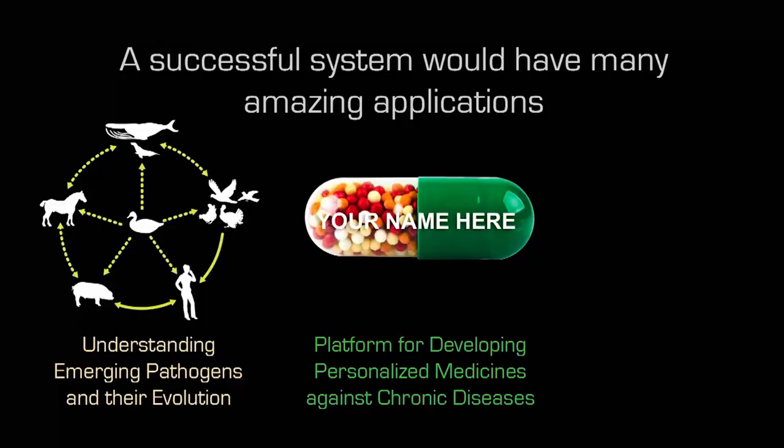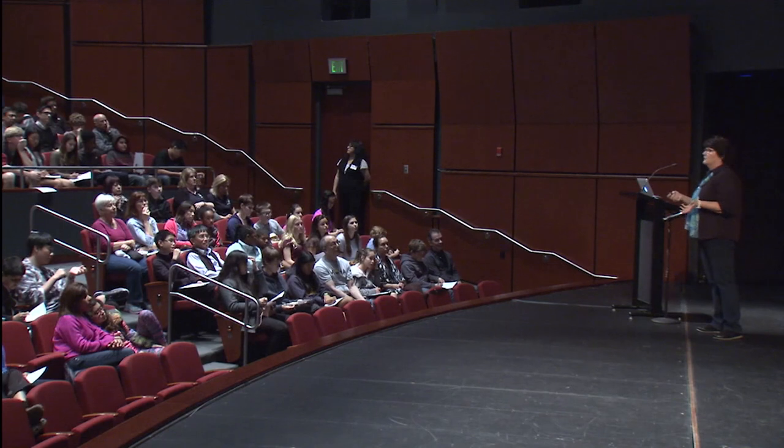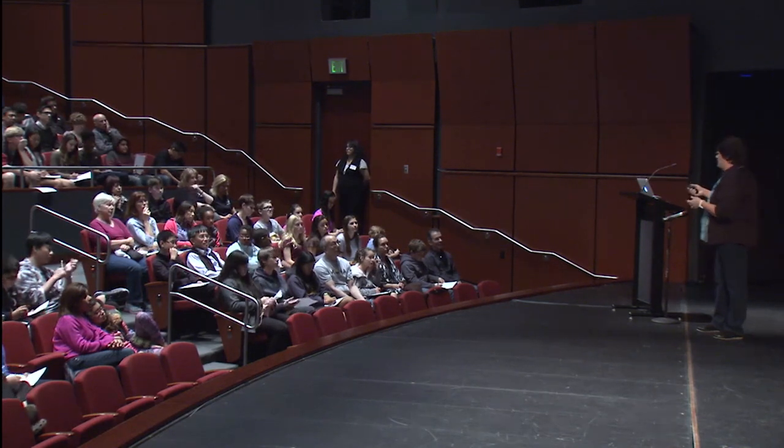And I also talked about the fact that we can't do enough testing to understand how drugs are going to work on individuals. Well, what if we could use this for personalized medicine? If we could take out stem cells from a particular individual and seed them into our human in a box and make basically a mini you or a micro you, then we could pre-test the drugs or chemicals on that particular person and get person-specific information about whether those new drugs are going to work or whether they're going to cause unanticipated side effects.